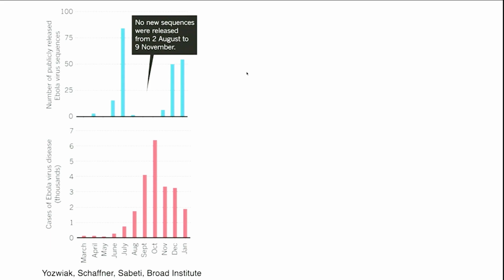So basically, source attribution works really, really well. It works well for these hospital outbreaks. It also works really well for foodborne pathogens. So in the US and the UK, all foodborne pathogens, E. coli, Salmonella, Listeria, are getting routinely sequenced and used for cluster identification to identify contaminated food sources. In Birmingham, we're also using whole genome sequencing routinely for Mycobacterium tuberculosis clustering and AMR prediction.